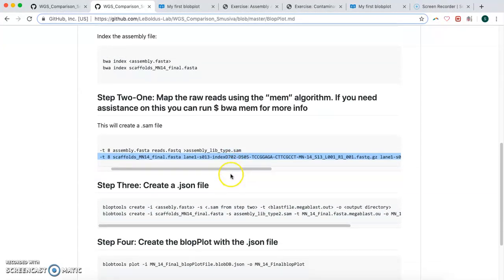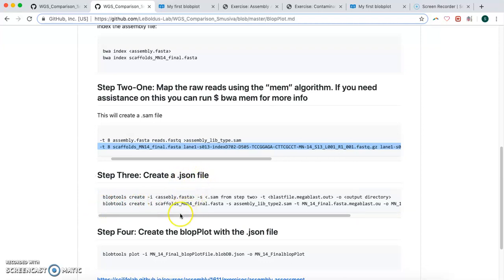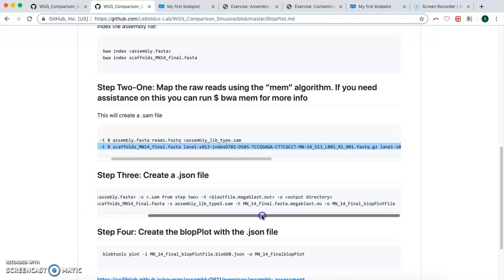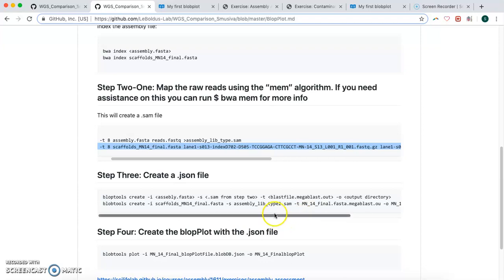So then after we have a .sam file created, then we use BBtools, blobtools, to create a .json file. And that's what this command here would do. It also takes a while to run, maybe a minute or two. I just don't want to put it in this video because it'll take too long.